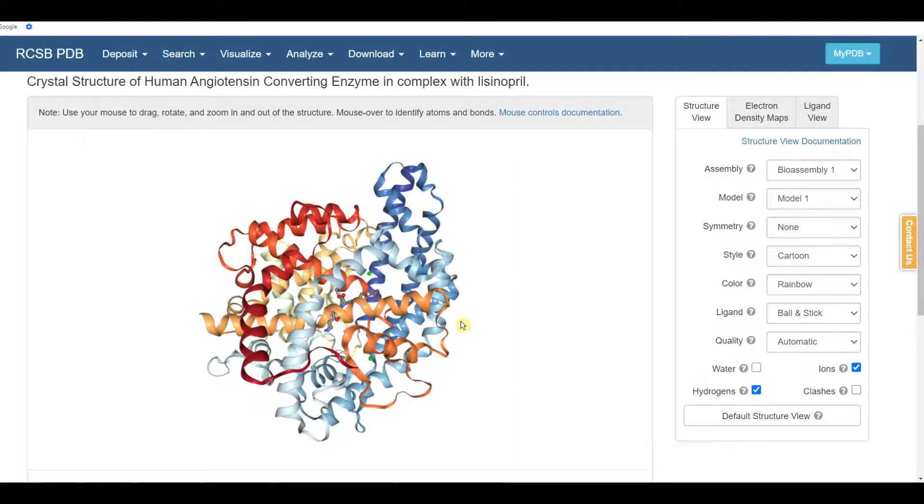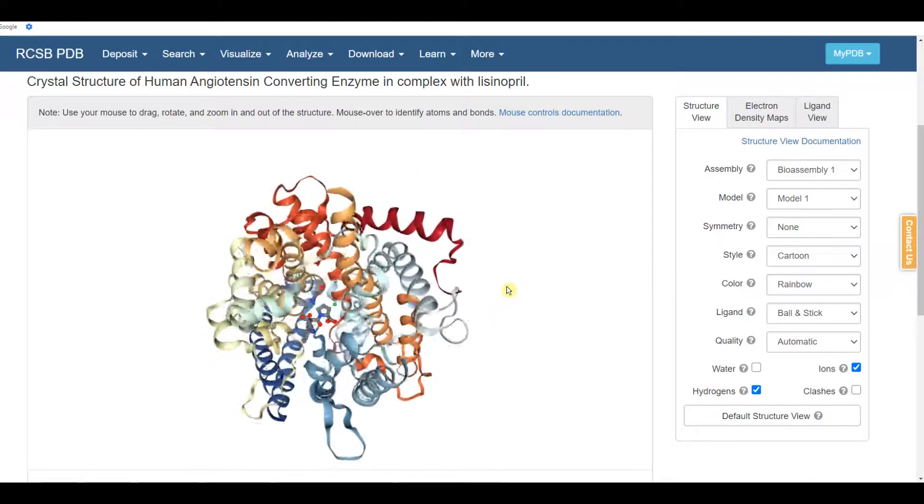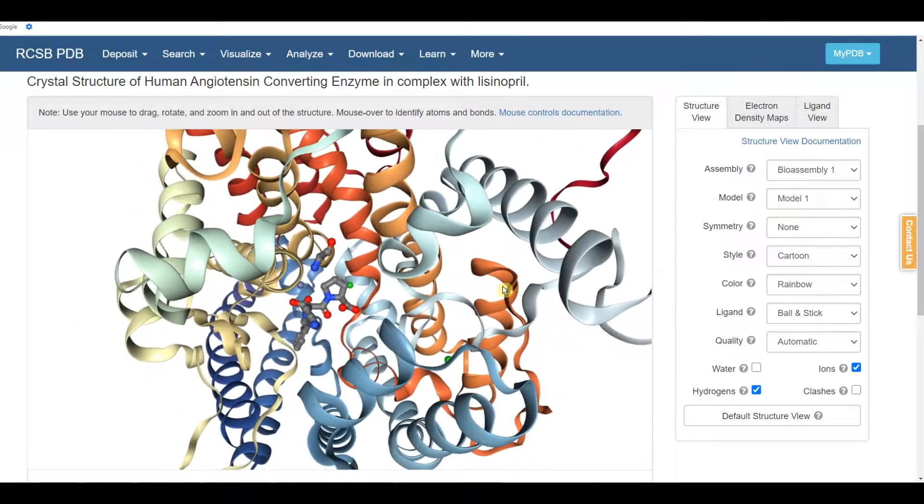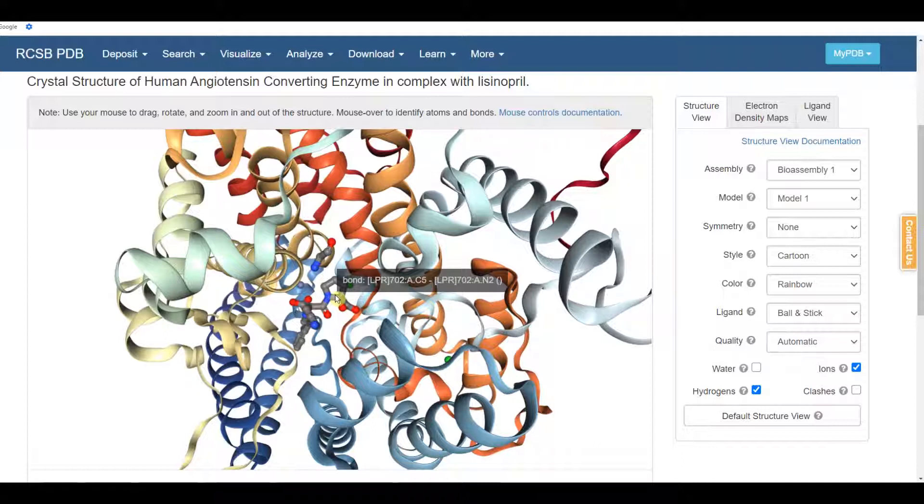If we look down into the protein, it's hard to find a view. There's a good view. Zoom in. There's a molecule hidden here in the middle. That molecule has been co-crystallized with angiotensin-converting enzyme.